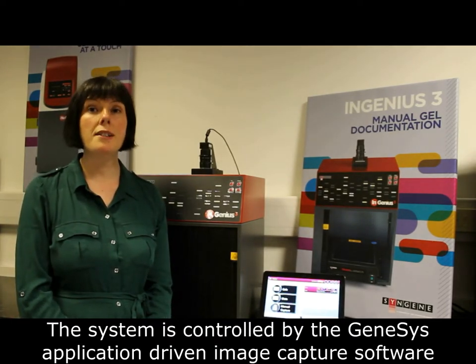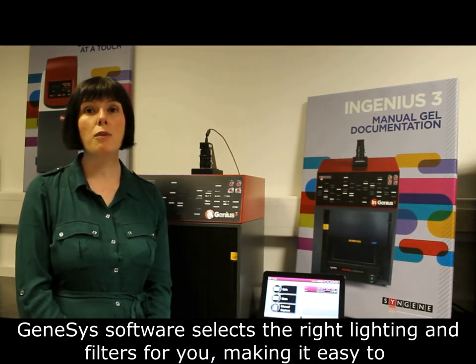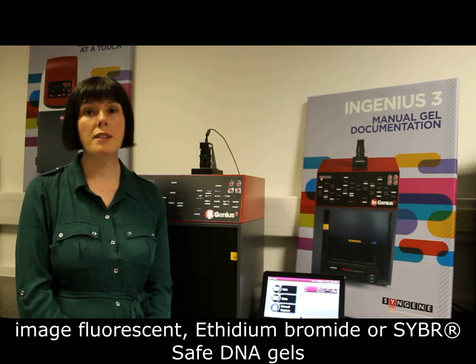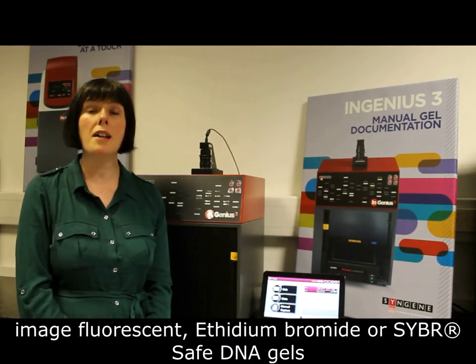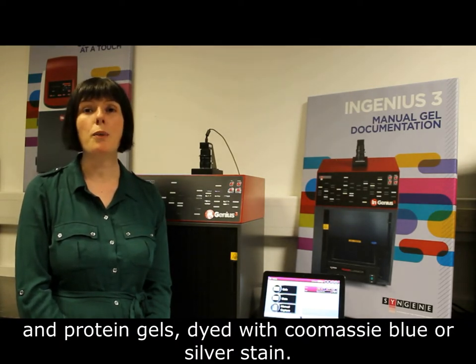The system is controlled by Genesys application driven image capture software. Genesys software selects the right lighting and filters for you, making it easy to image fluorescent ethidium bromide or SYBR Safe DNA gels and protein gels stained with Coomassie Blue or silver stain.